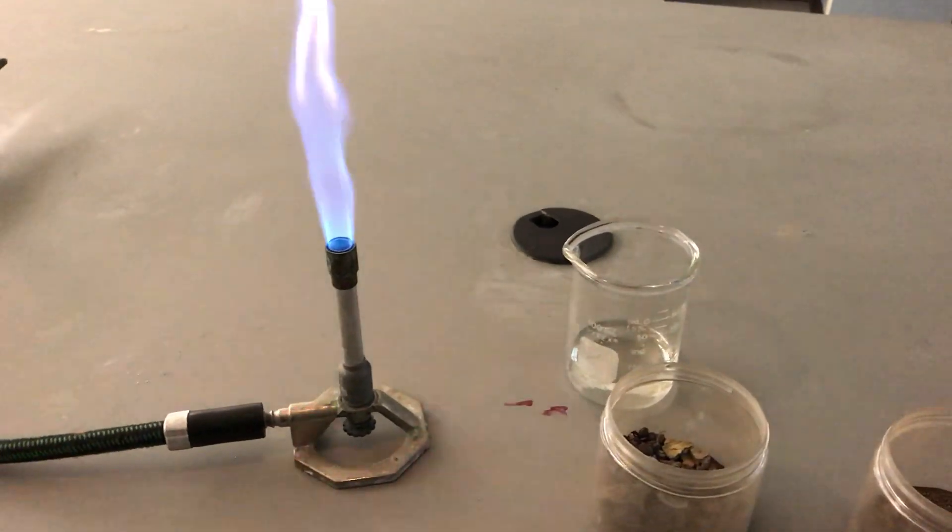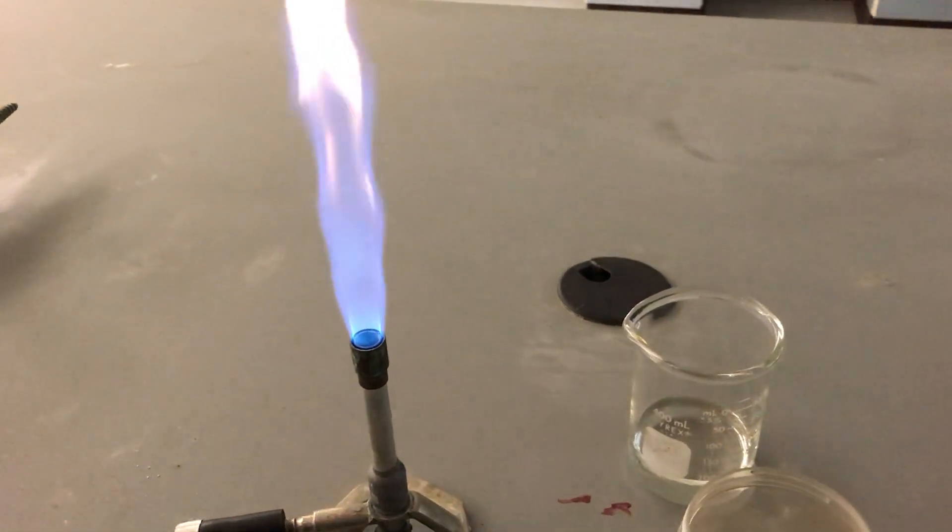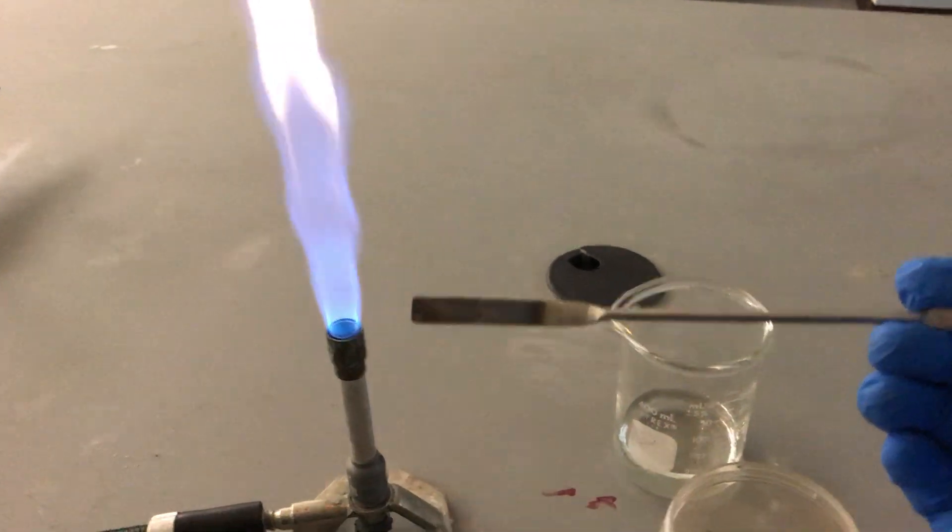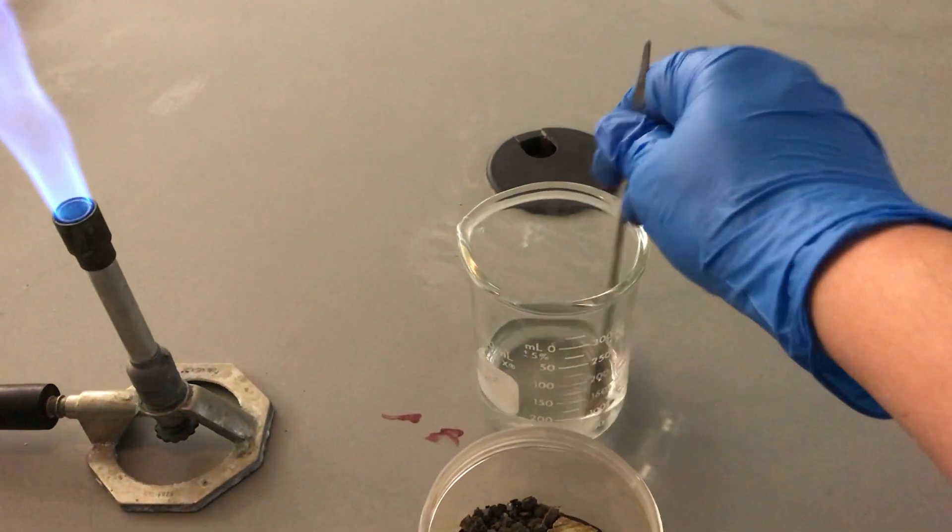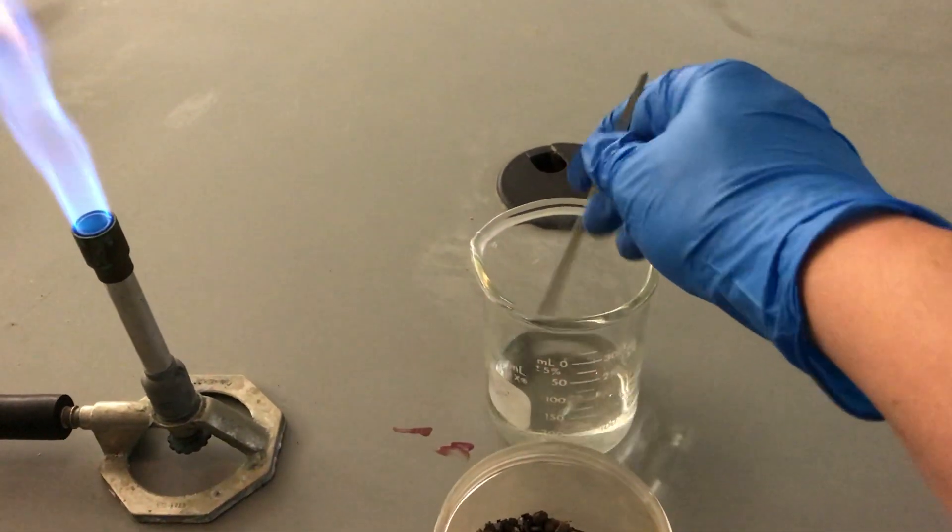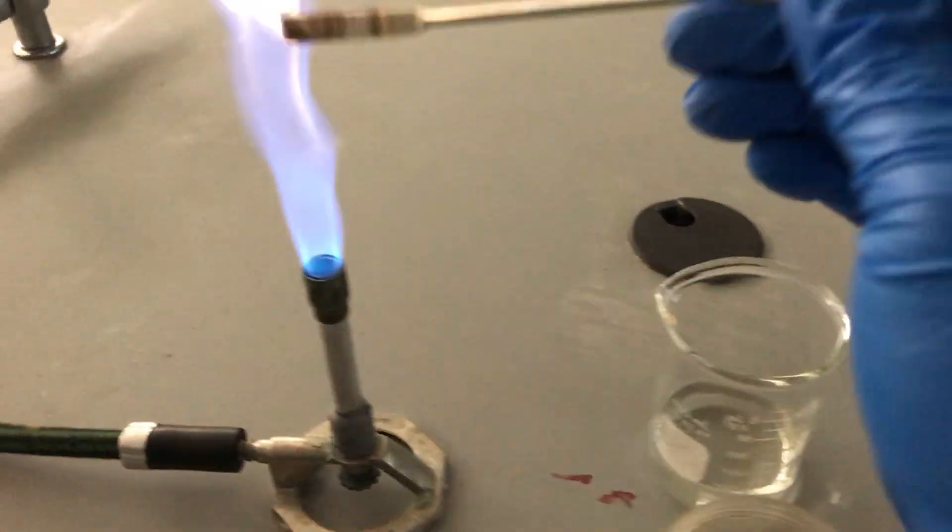So how do we conduct a flame test? Well first you need a spatula to sample your soil with. Before we use it though, we're going to make sure that it is completely sterilized and free of any contamination. So we're going to dip it into our nitric acid, like so, stir it around a bit, and then we are going to flame it off.